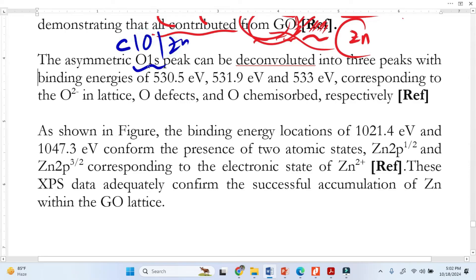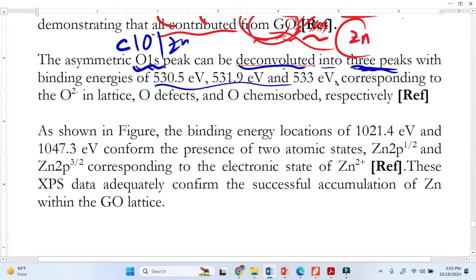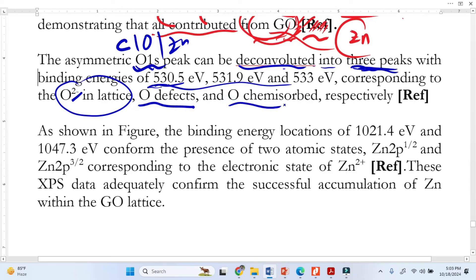We also interpret the oxygen peak. We take the high-resolution O 1s spectrum and deconvolute it. Although only one peak was initially visible, deconvolution reveals three peaks. The corresponding binding energies belong to oxygen in oxidation state 2⁻, lattice oxygen defects, and chemisorbed oxygen respectively. Again, add a reference here to validate your claim.